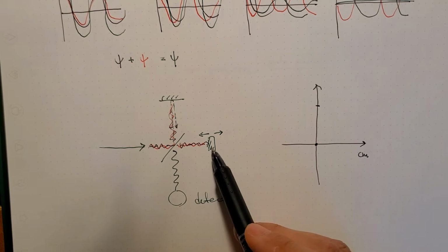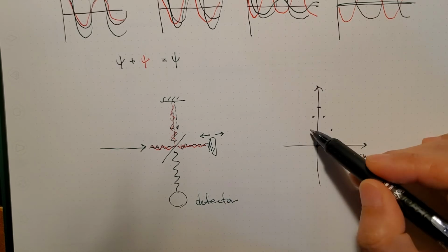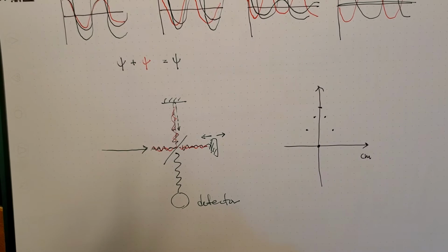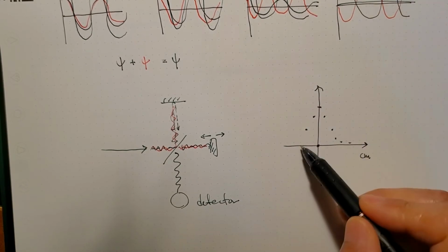As you move in or out in either direction, the intensity decreases. If you move more, it decreases. If you use Mathematica and actually put different degree angles in the formula we had before, and then try to make them interfere, you'll see the drop is very significant, something like that.